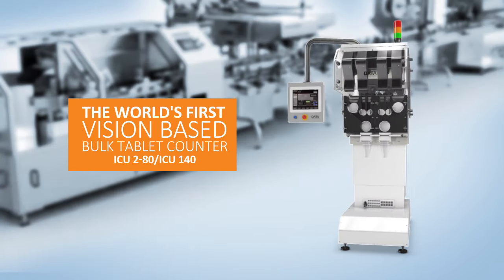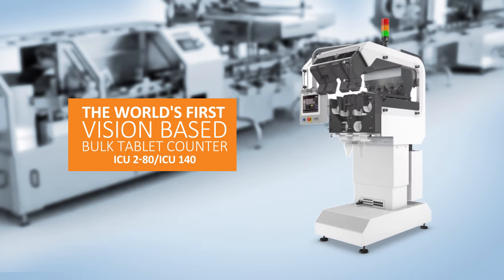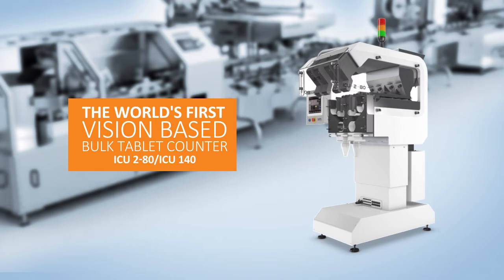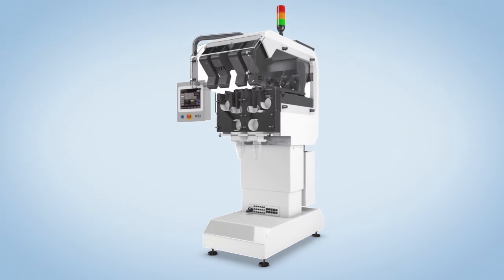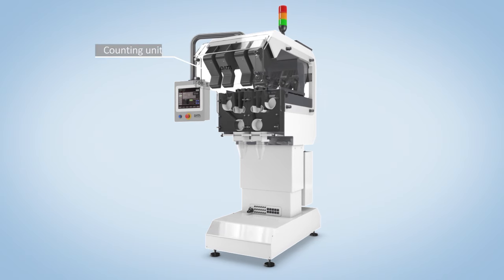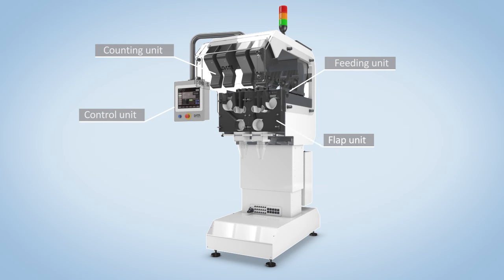Introducing the world's first vision-based bulk tablet counter. With Datatex ICU, tablets don't need to be separated over multiple channels, nor do they need to be fed one by one or spaced at specific intervals. They are, in fact, counted in bulk.